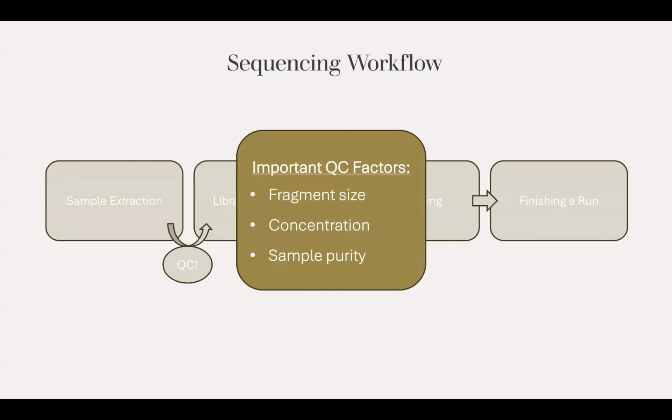And then finally, this also goes for RNA, but in general, it's best to elute in smaller volumes because, of course, it's much easier to dilute your sample if it's too concentrated than to re-elute and try to shoot for more concentrated samples.